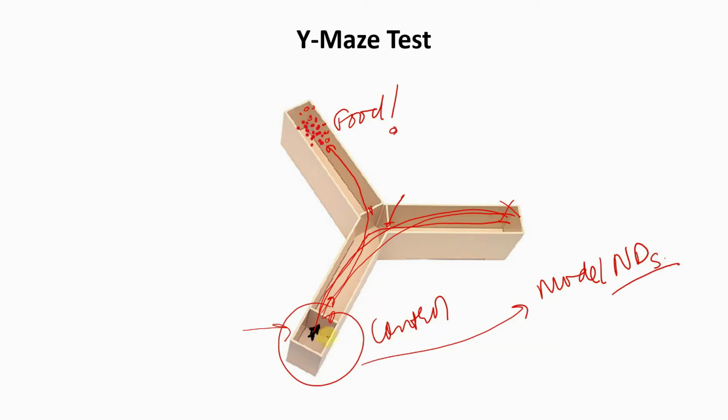And then when the subject, let's say, has Alzheimer's, you are going to put the subject here, but since you have given the subject training on whether to go left for the food or to go right for the food, now the testing phase will come. So you'll keep on doing the testing on a regular basis, of course, but when the subject is really critically suffering from a neurodegenerative disorder, the subject will not be able to find where the food is, right? So the Y maze is one of the tests which people use across the world to assess the memory of zebrafish.